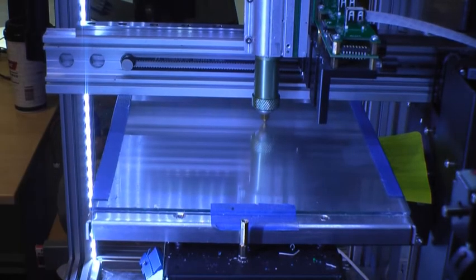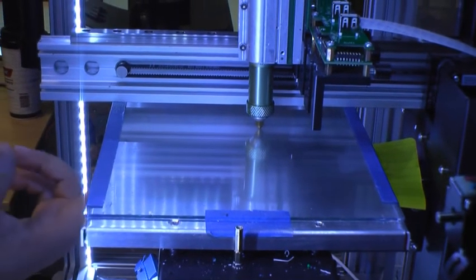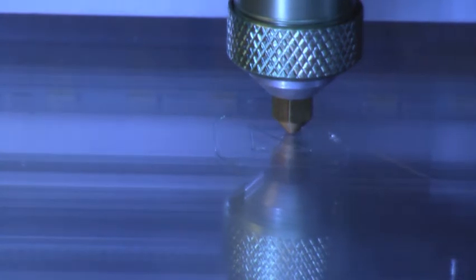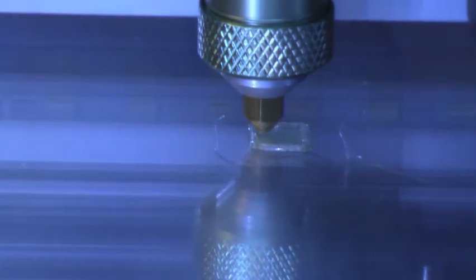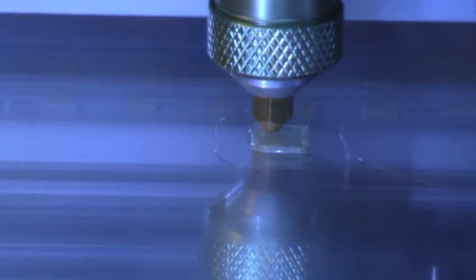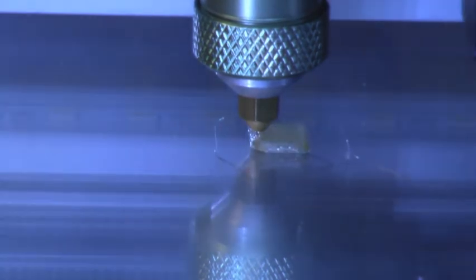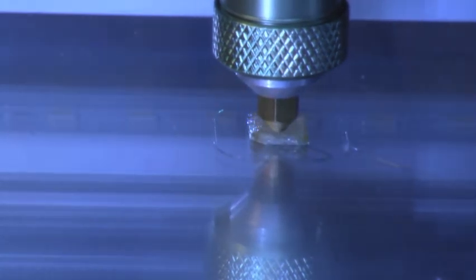Alright, now we're going to set our zero position for the head. We're going to purge a little bit of material out to make sure it's flowing right. And now we're going to start our print. This is a little pyramid. It's 10 millimeters on a side. It gets about 5 millimeters high. Here you can see it printing nicely.